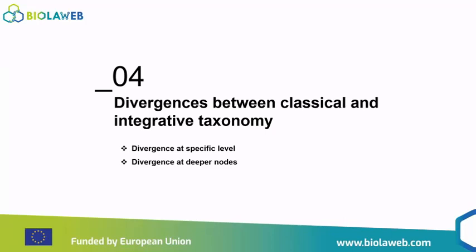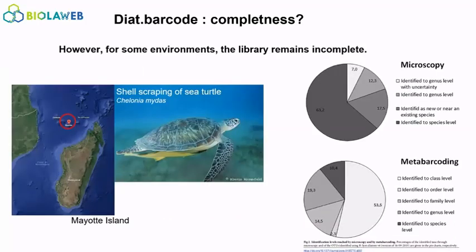63% is okay. You determined 63% using microscopy and only 10 by metabarcoding. But how can you not use those samples to add them to your database? So later you can.